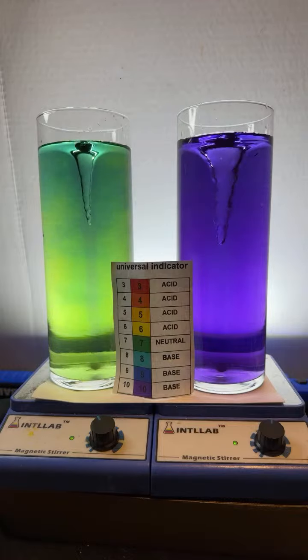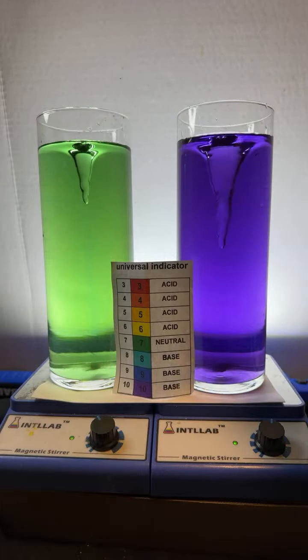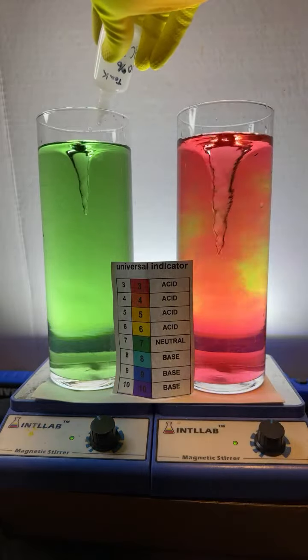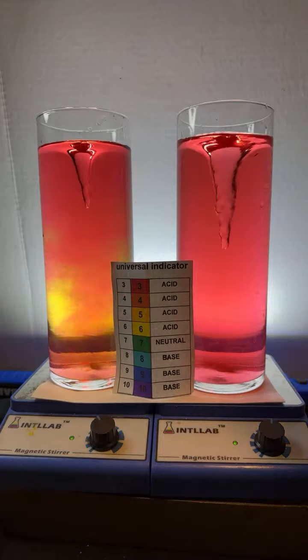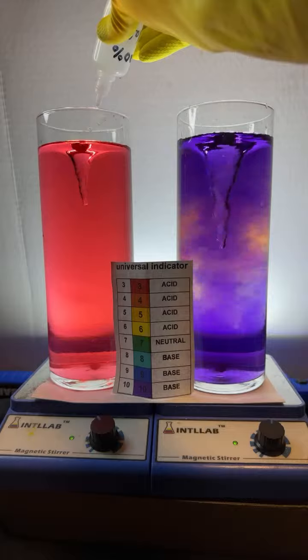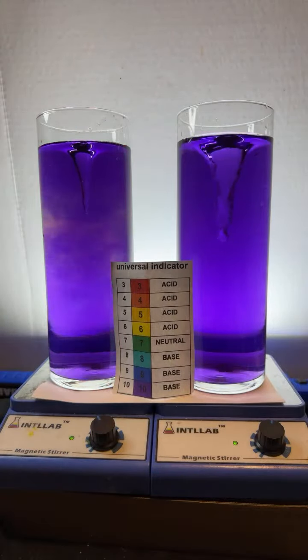So pH of 6 or below is considered acid. That's right, Samir. What am I adding? I'm adding hydrochloric acid, 20% by weight, over here on the right. Over here on the left, let's add it here. And then I can add 20% by weight sodium hydroxide, over here on the right, over here on the left. And you can see what happens to the different colors and see the various pH values.